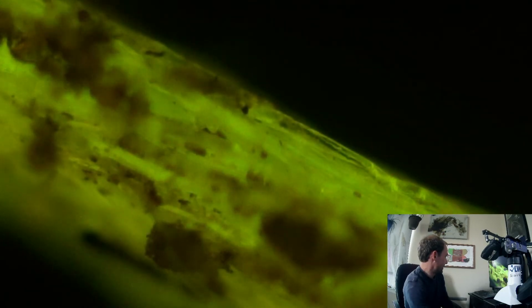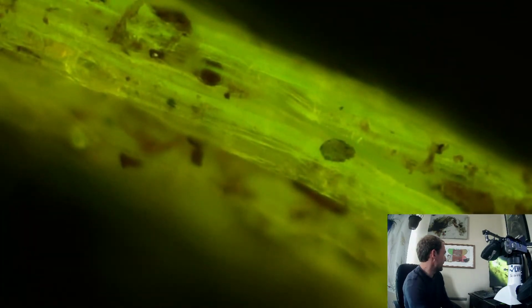Yeah, we're at 4x digital zoom here. Definitely glowing very brightly. It's a good sign. Got plenty of phosphorus for the moment.